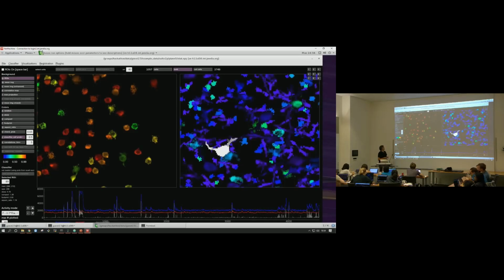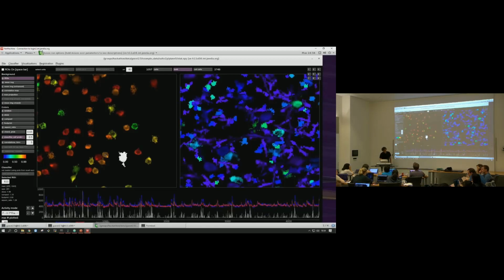And what we're thinking of adding during this workshop is to build another classifier that's based on the shapes of the cells. And things like that should be a lot more easily identified by shape than by these particular metrics. So when you showed us the presentation in the morning, it seemed like most of the cells were within a skew of 4, but then I saw a few cells when you went through that the skew was 12 and 14 and stuff like that. Does that mean anything?